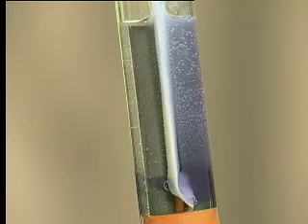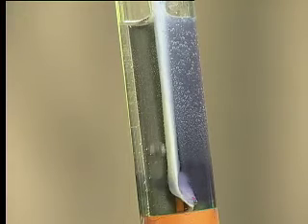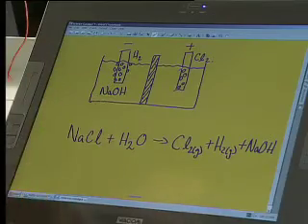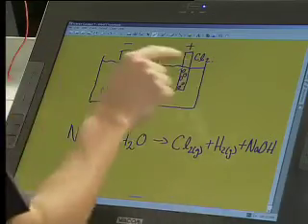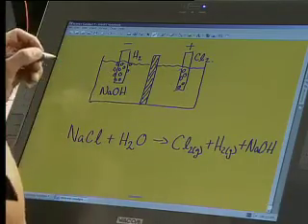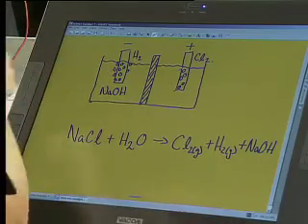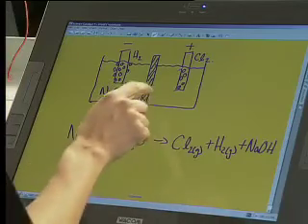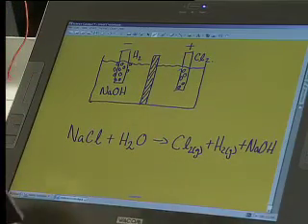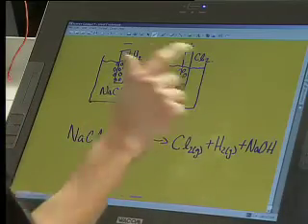What we're going to do is quickly recap on our diagram. We're going to see exactly what's happened, and it's worked fantastically. Back to our diagram, we've got hydrogen and sodium hydroxide produced at the one electrode. This is why it's called the chloralkali industry. Your sodium hydroxide is the alkaline material in there. That's used in soap manufacture and bleach manufacture. Chlorine is used in plastics. It's used in a variety of bleaches and cleaning products as well. You can see that being produced in the yellow.